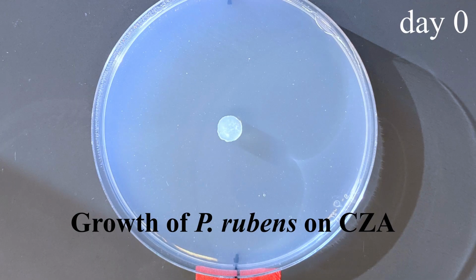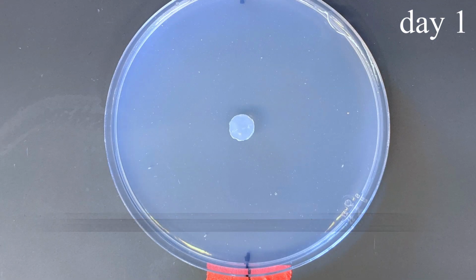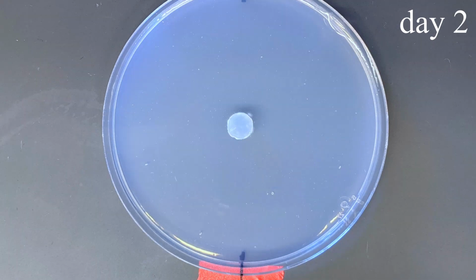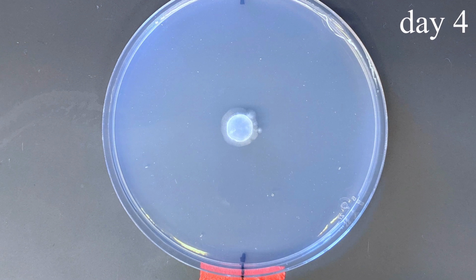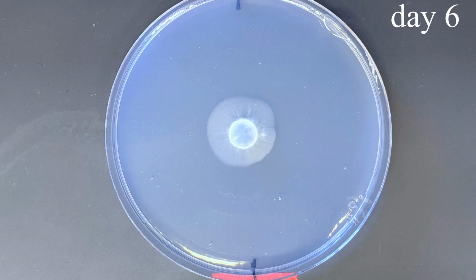In its favorite environment, P. rubens can grow quite rapidly. When it grows on a sterilized agar plate at 25 degrees Celsius, its colony can cover the whole plate within 3 weeks after inoculation. In general, P. rubens love room temperature and a humid environment.